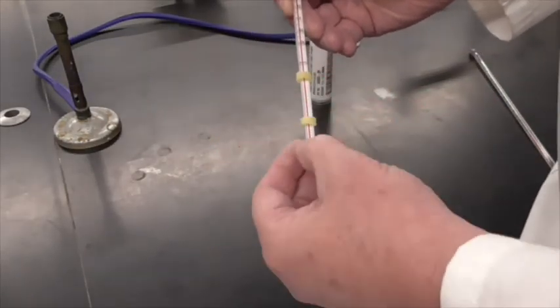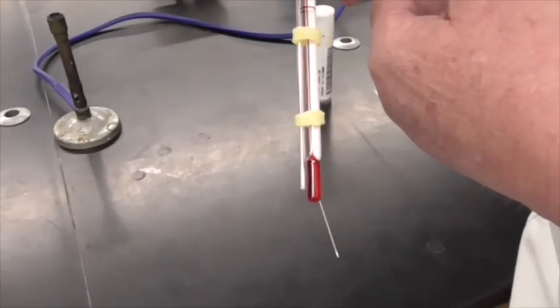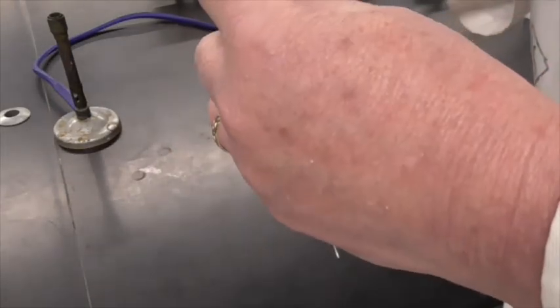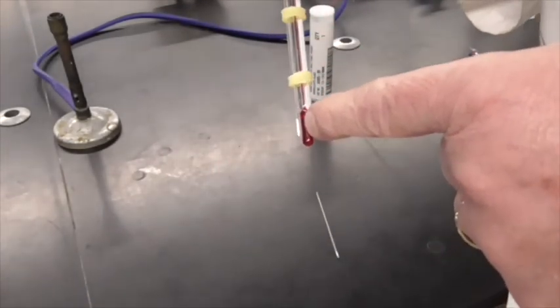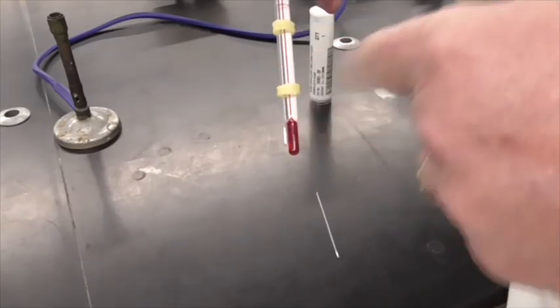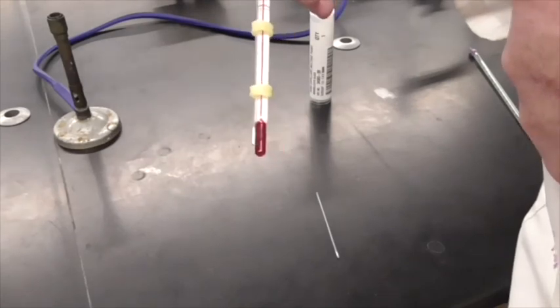Okay. So now you can see that the capillary tube with the biphenyl in it is sitting right next to the bulb. Okay. So now I'm going to put this in a beaker of water, and then I'm going to heat the water and watch it as it melts.